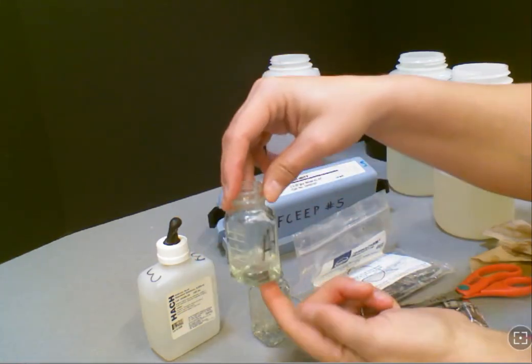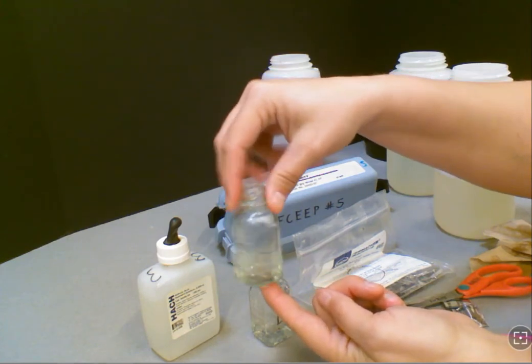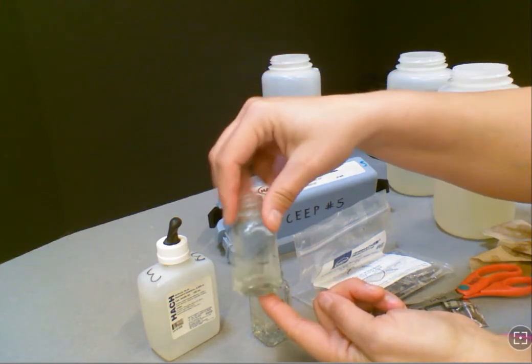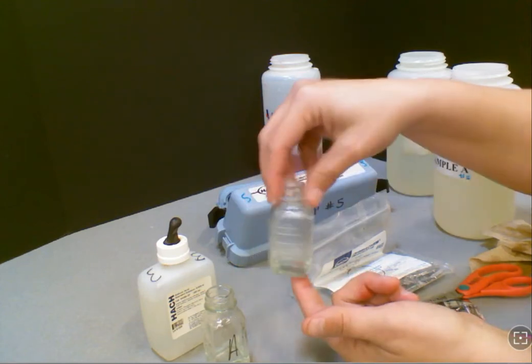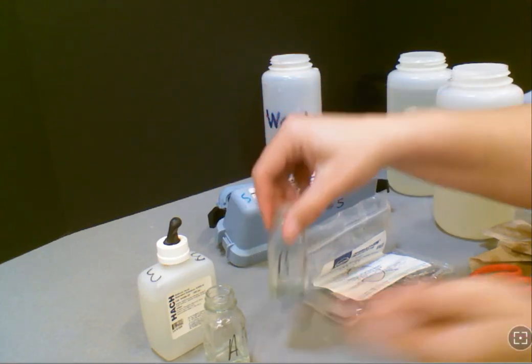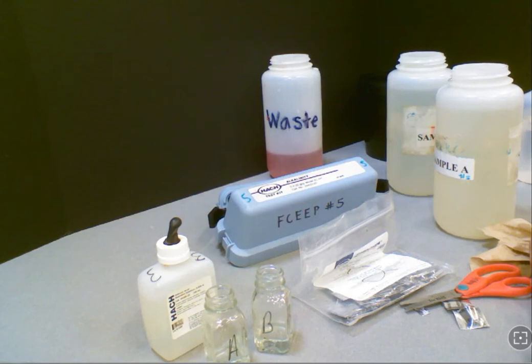After you've poured in your phenolphthalein, you're going to swirl both sample A and sample B until the contents are mixed. At this point, your instructions will state if it remains colorless, jump to step 6. This is fairly normal in this area, so don't be alarmed if it's clear.